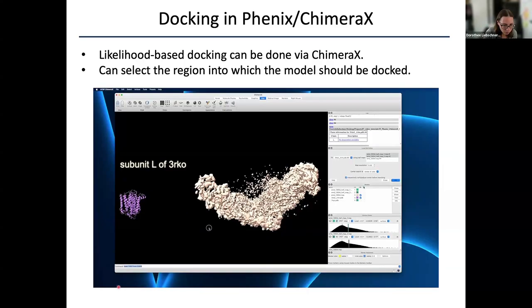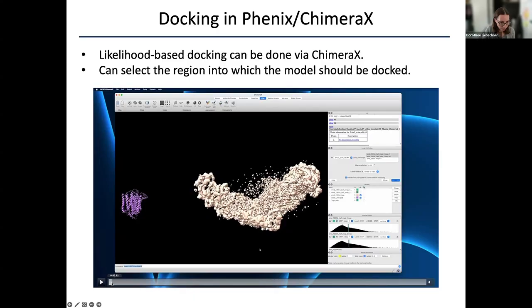If I manage to do that, it's really hard. Yeah, let me go here. Okay, here we go. Sorry for that. It's the little laser pointer that throws me a little off.